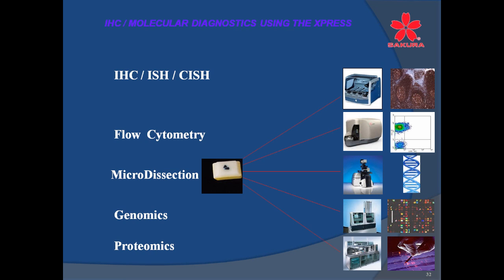It was really humorous one day, and I felt sorry for the researcher. He'd done all of his work, and he had the right idea. He was going to do immunohistochemistry, so he had all the dissections put on positive charged slides, which we would have done. But then he didn't tell us that he was going to do microdissection, use laser capture to remove cells, so it obviously couldn't be done, not very well, and so he had to have some of them recut.